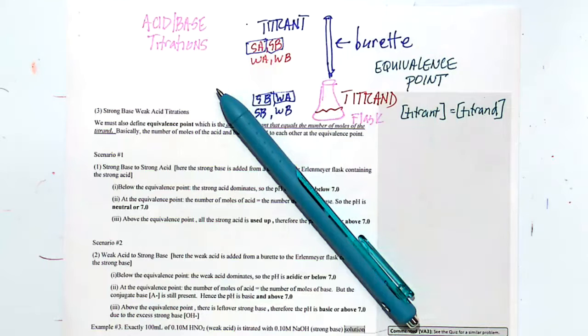All right, so acetic acid, or weak acid, also known as vinegar, is done. It's our titrand. I'm going to titrate this with the strong base sodium hydroxide. Okay? What I like to do, and when I tell students at Chem Lab, I tell them fill it all the way up. So that you don't want to measure your volume. It's easy if you fill it all the way up. You can just read it. I added 17 mLs. I added 26 mLs.